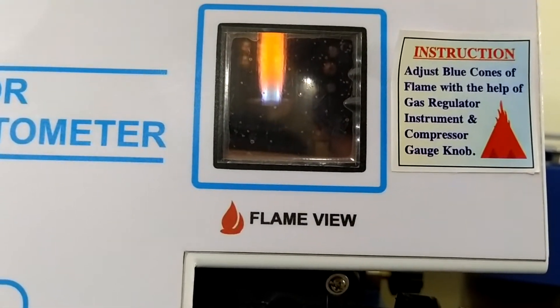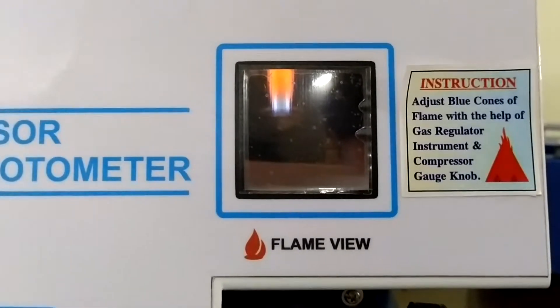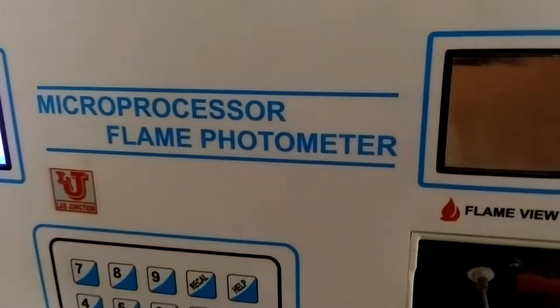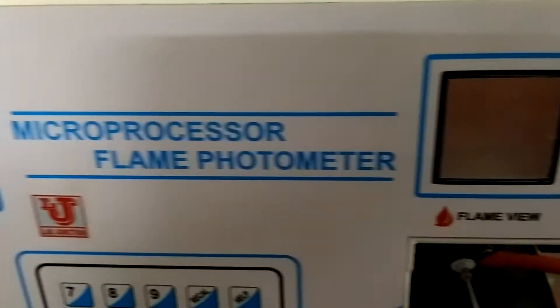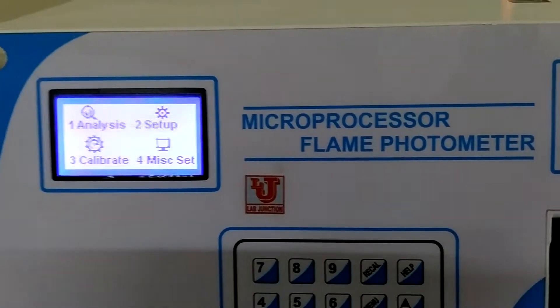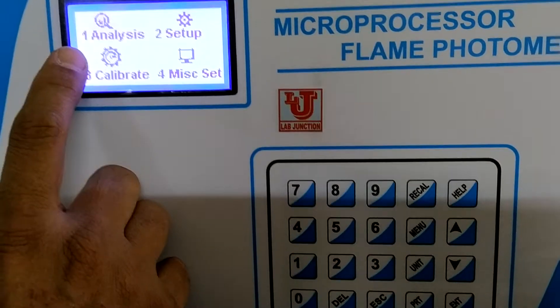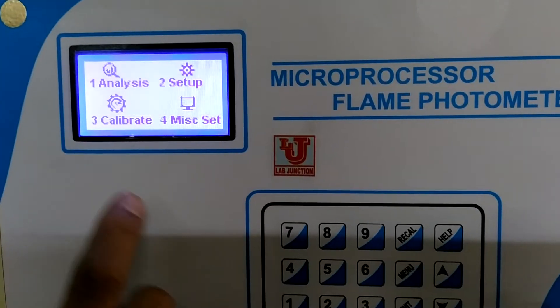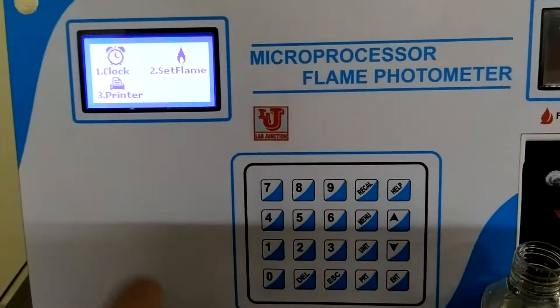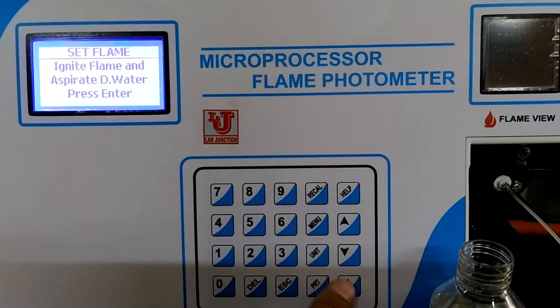In this way you can set the flame of the flame photometer — this is the main thing: flame setting. Now, how to analyze and calibrate the flame photometer. Go to the menu: 1 is Analysis, 2 is Setup, 3 is Calibrate, 4 is Miscellaneous Setting. Under miscellaneous: 1 is Clock, 2 is Set Flame, 3 is Printer.